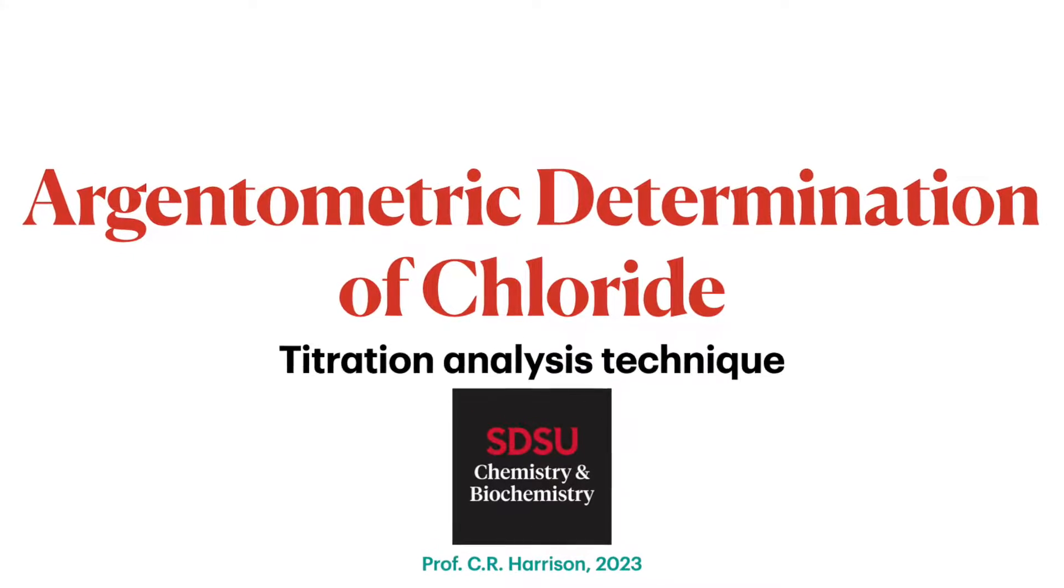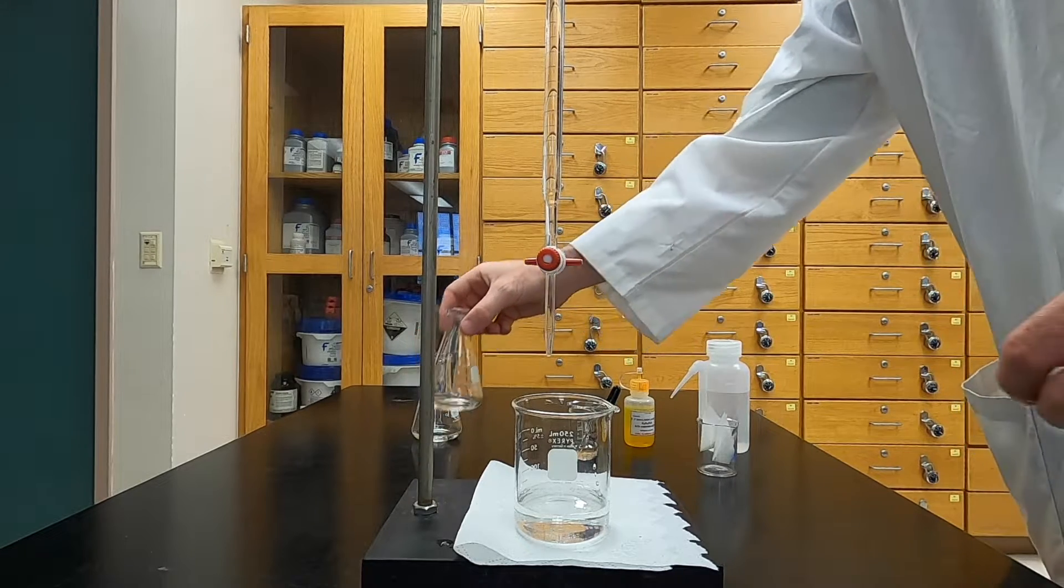This video will demonstrate how you can analyze the chloride content of a solution by titrating it with silver nitrate.